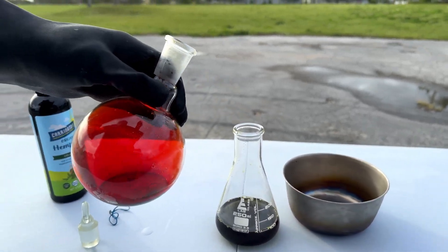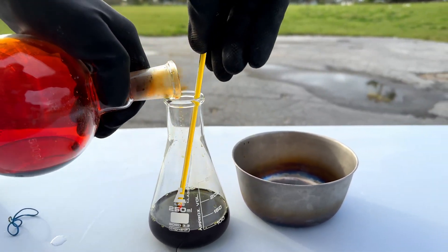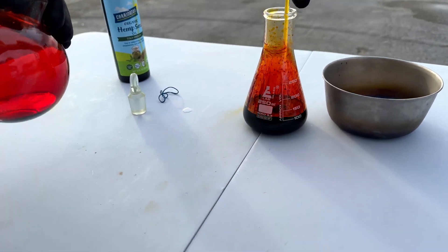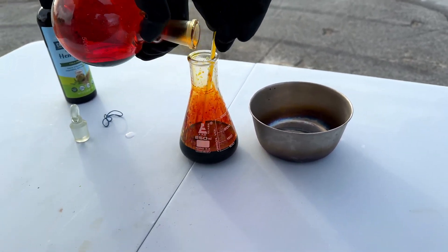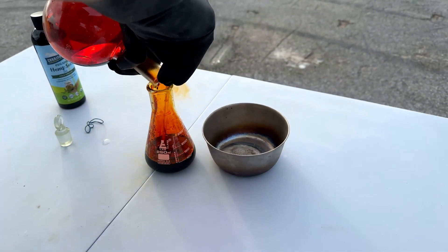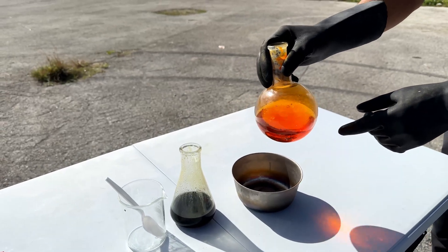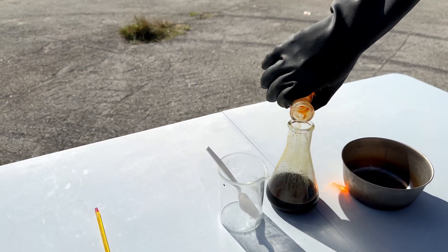Now we're going to slowly add this in. You can see those fumes — that's why you should do it slowly. After brominating our oil, I further diluted the bromine vessel with water. We're going to also add this in to make sure the oil is fully brominated.